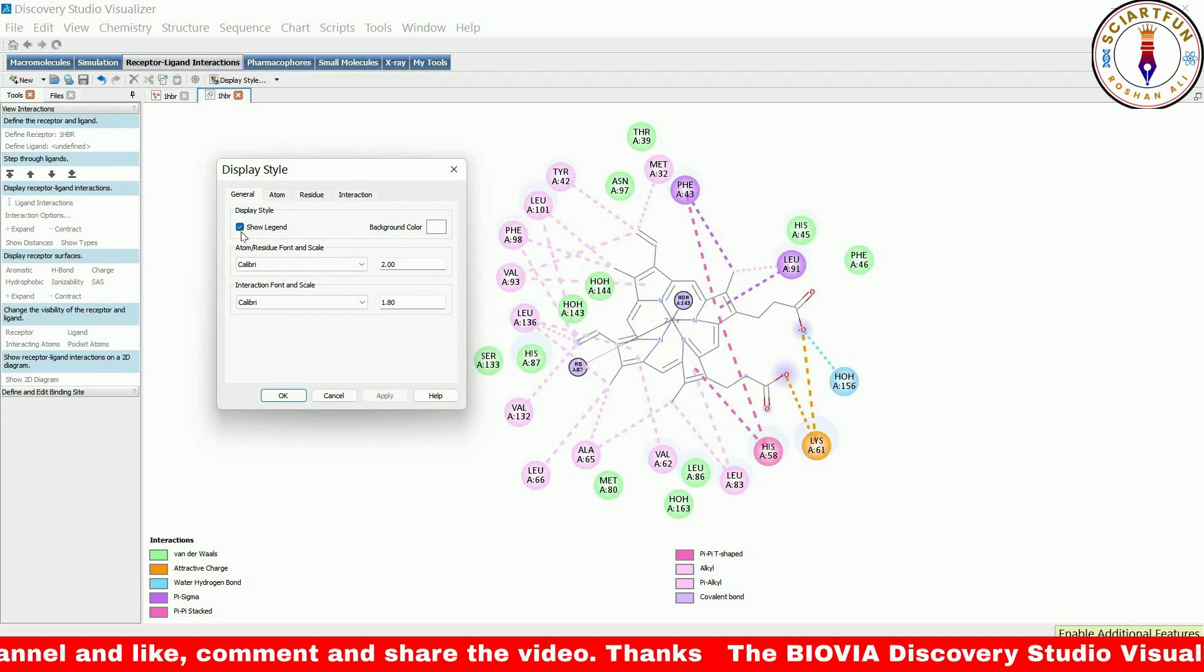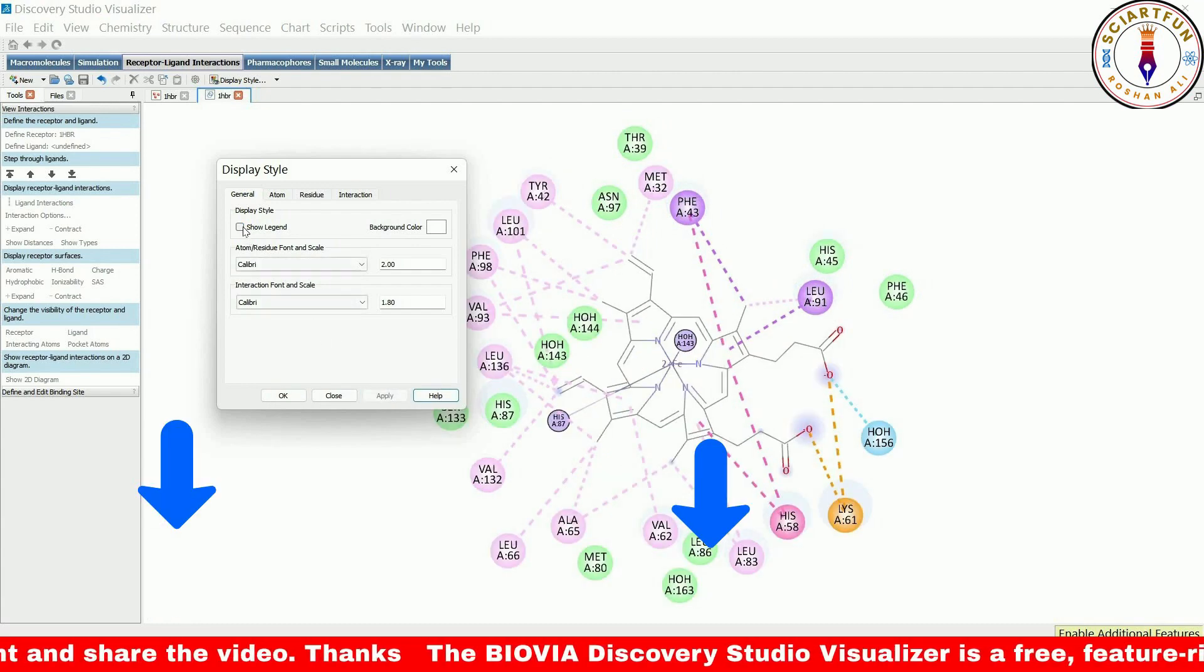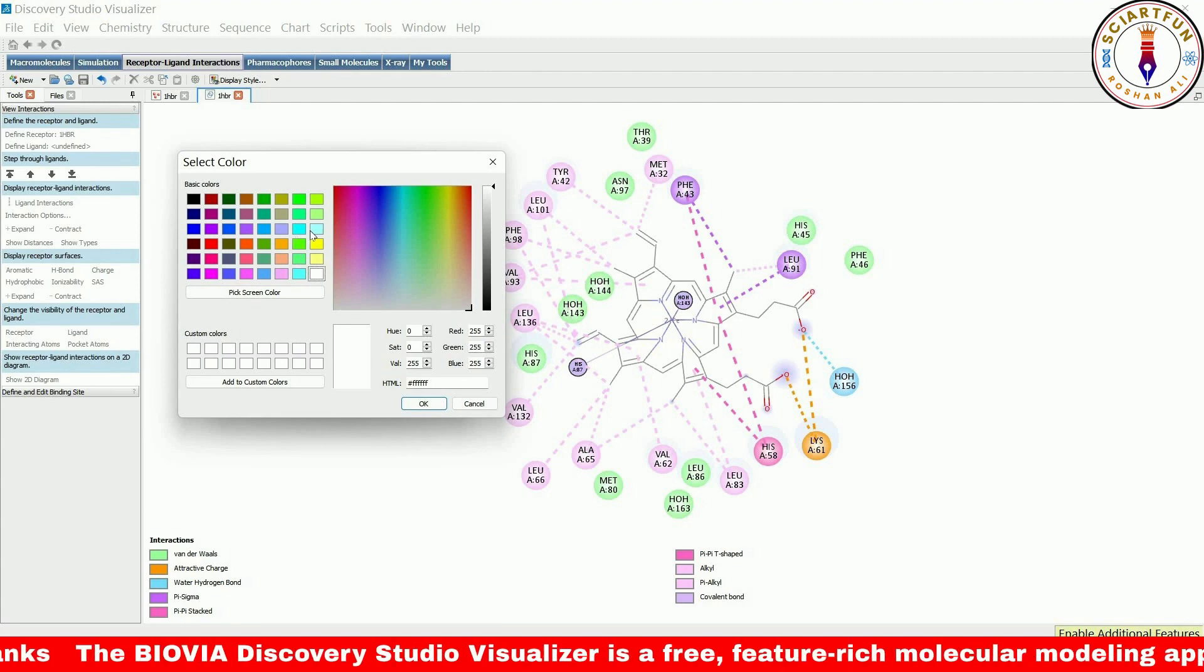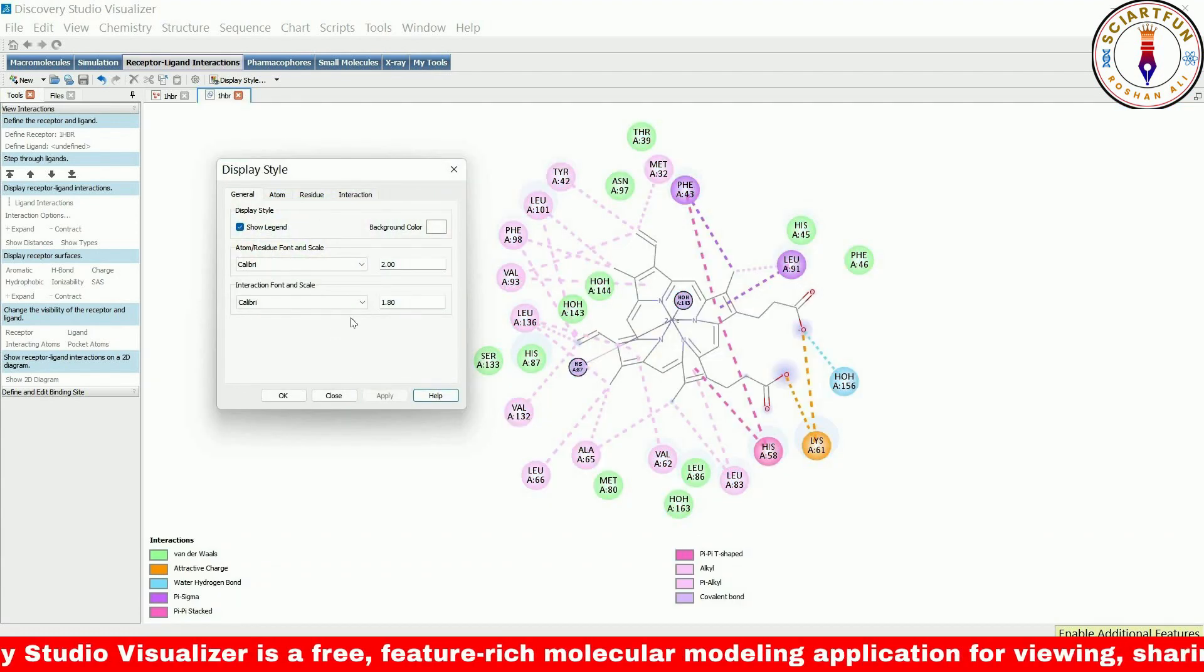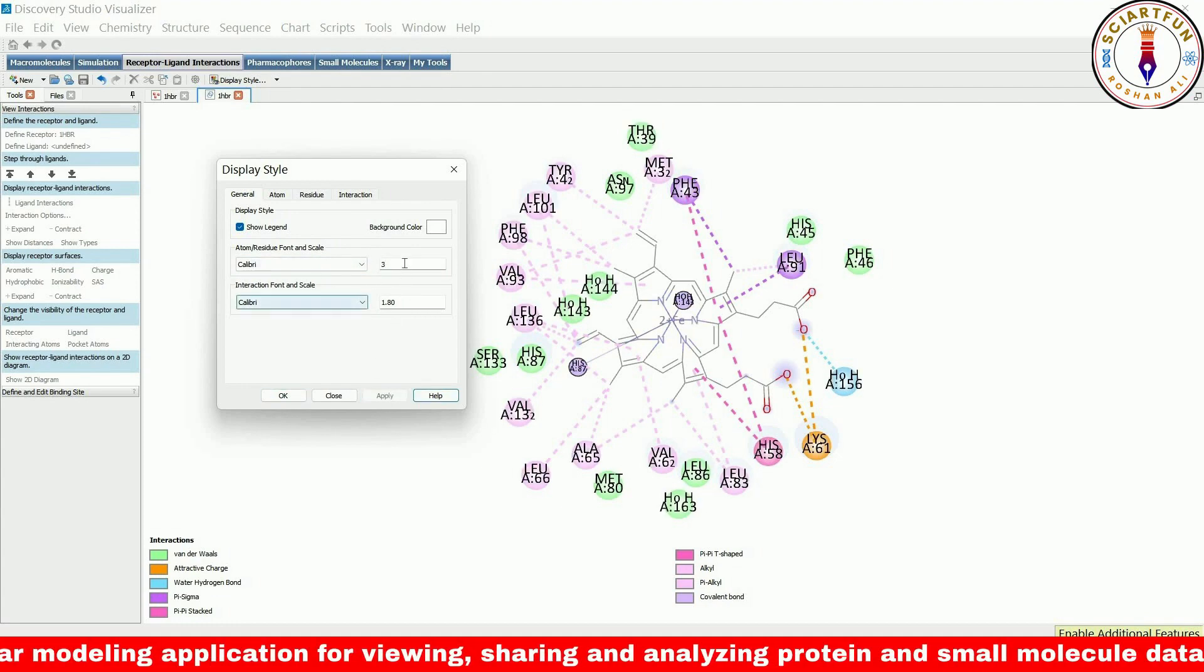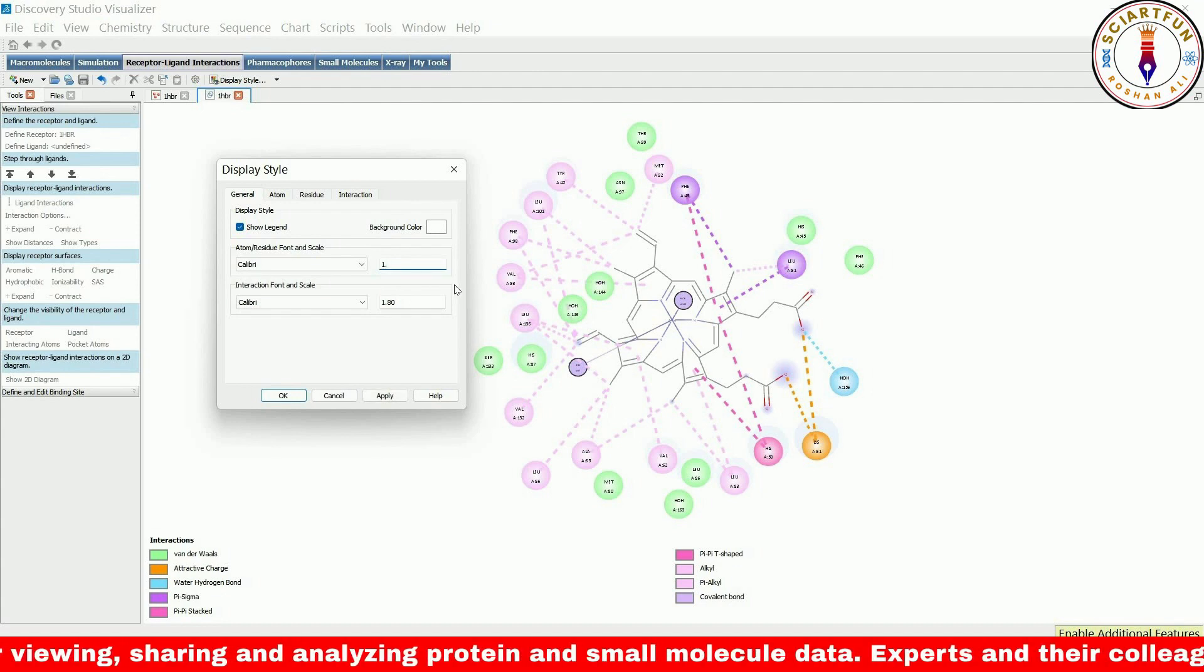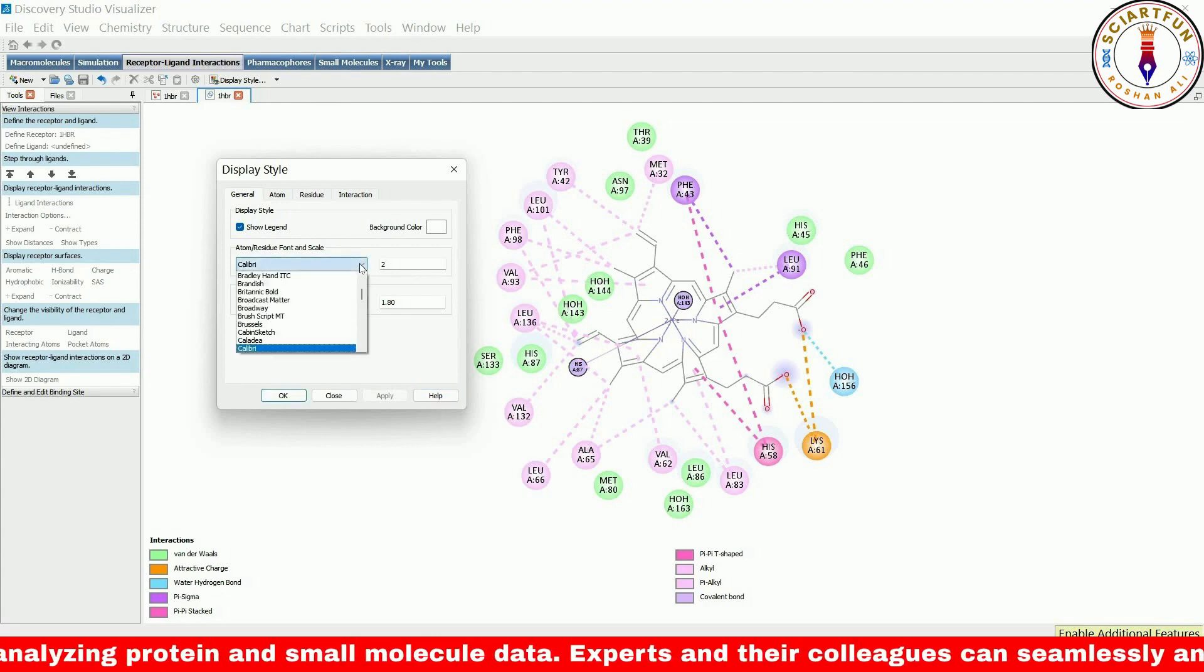In the general tab, we have the option to show or hide the ligand. We can also change the color of the background and increase the font size of atoms and residues. We can also change the font style of the text.